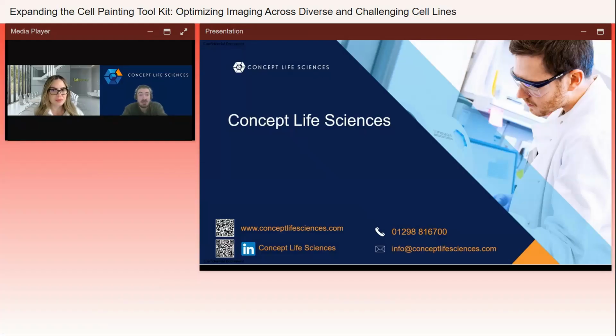It's something that you will get a feel for. You can do individual channel scans that you can see. And as I've mentioned with the dead or dying cells, if you have a spec that is consistent in the same space across multiple channels, you'll probably have a good indication that that is going to be something that's not a true signal.